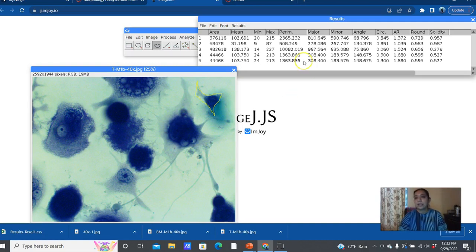And so these are some different types of measurements that you can make with ImageJ, some of which we are not able to do with typical microscopy by itself without the help of computer software like this. Especially for those labs that are remote this week, my Wednesday, Thursday, and Friday sections, definitely take advantage of it.